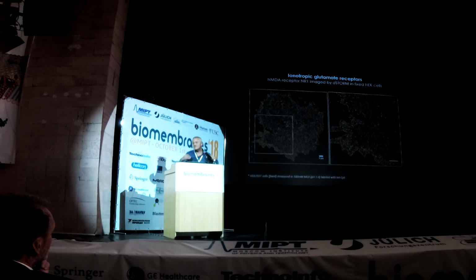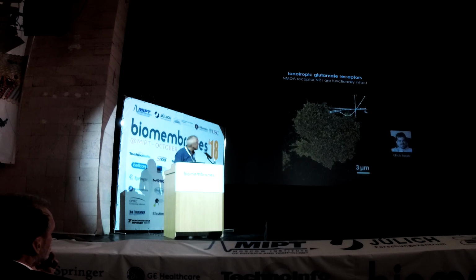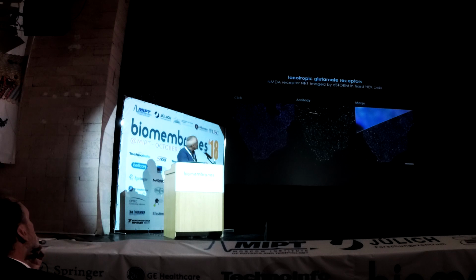And then you can do super-resolution microscopy and come up with images, which of course depend on the expression rate, the transfection efficiency, and all the other things. The next thing you have to demonstrate is that these receptors are still functional. This has been done by Ulrich Terpitz, who is doing electrophysiology, to demonstrate that these NMDA receptors are still okay. They do their job. And I will stop with this transparency just to show that labeling with click chemistry is much more efficient than with antibodies, because of steric hindrance and maybe other problems associated with the antibodies.